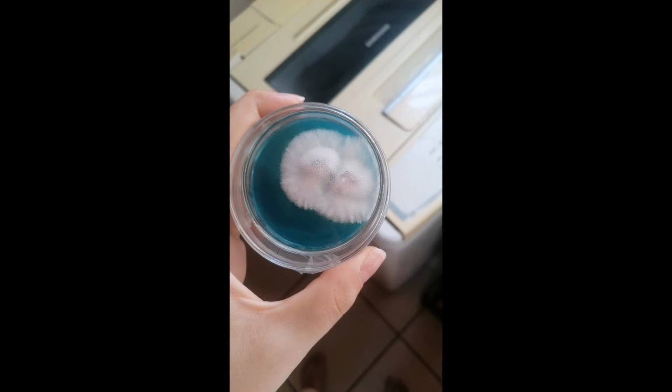Hey everyone, this is Hippie Flower Girl, and this is the process that I follow in order to make agar plates. So I use glass petri dishes. I don't use a pressure cooker. I just use a steam bath, and I use light malt extract agar. So these are the results I have gotten previously. Without taking too long, let's get started with the video.